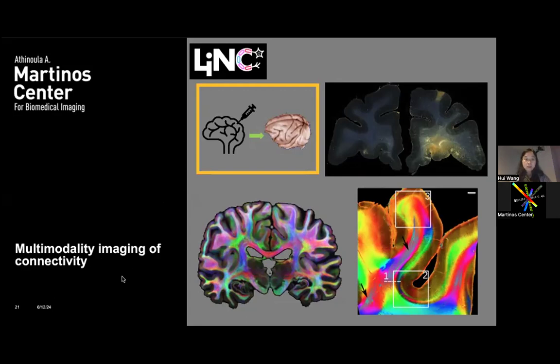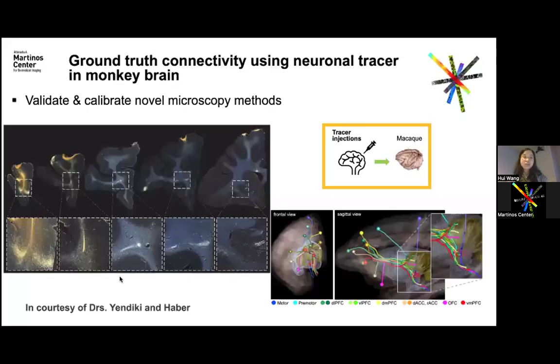So in this part, like Bruce asked, how true the fiber connectivity really is, as revealed by PSOCT. In the past 5 years, we established a multimodality pipeline where we image a whole brain by ex vivo MR or diffusion MR, and then we do PSOCT and slicing.